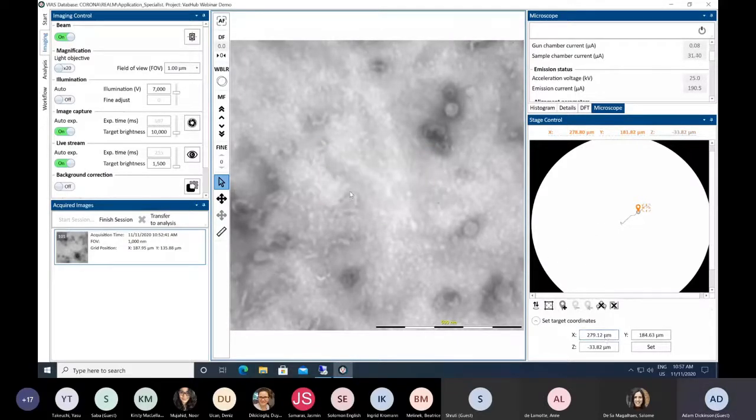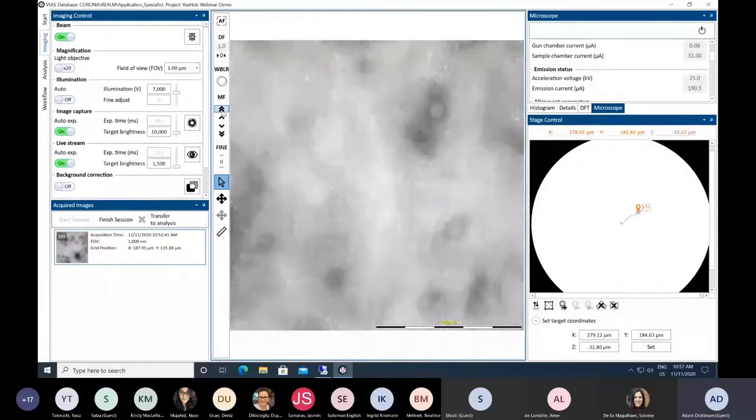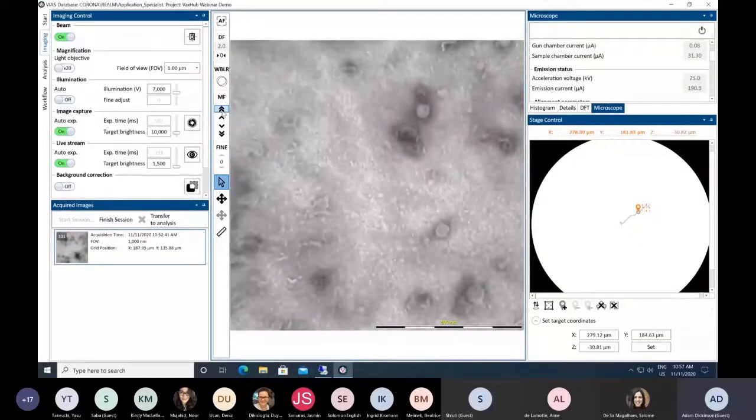Great, now that's just about done. Again, it's a little bit out of focus for my eye and how I feel the image analysis algorithms will work. So again, I'll just use the manual focus here to move up 1 step at a time, just so that the defocus value changes 1 step with me. That's 2, and I think again 4 seems to be a good position.